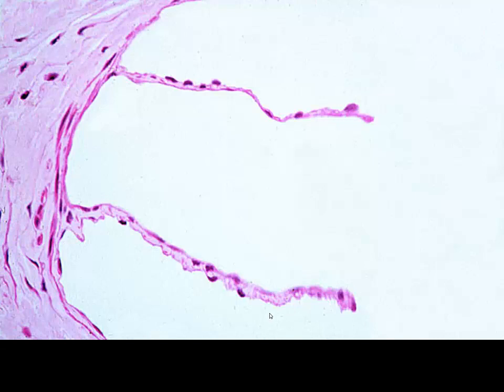Now, as we went through in lecture, we talked about the lymphatic vessels and veins having unidirectional valves built into them, almost like the cusps that we see of our semilunar valves. Well, these are sections through some of those leaflets of the valves in veins.